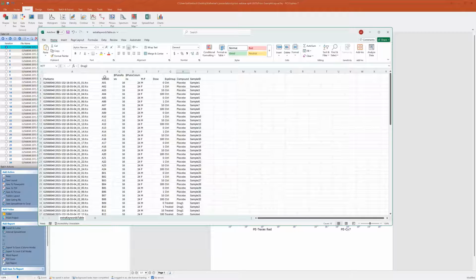So these exact keywords are not necessary. What you would want to do is create keywords that are meaningful in your experiment. The whole reason that we are assigning these keywords is that we want to be able to group our FCS files into groups. This will help us to organize those statistics from each of those FCS files into our Prism tables. The Prism tables are going to be organizing the statistic from each of these data files according to the groups.